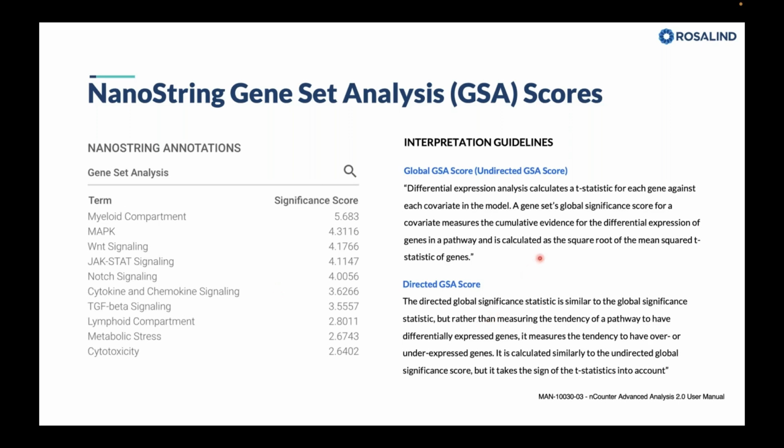On the right-hand side, these are excerpts from the manual, the advanced analysis manual from NSolver, that describes these pathways, how they're calculated and what they mean. I know that not everyone reads the manuals, so I wanted to pull this information and put it on this slide, and let's talk about this and then break it down so we can have a full understanding of what these scores mean. Because at face value, these really don't have any meaning by themselves. There's no p-value associated with them. It's really hard to interpret.